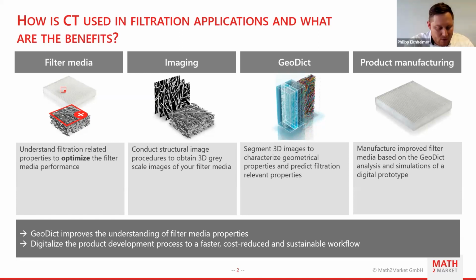Yeah, so in general, to use our software quite well, we have a rule of thumb. The smallest fibers, if you talk about fiber structures, should be resolved by 3 times the voxel size. This is to have a good representation in the software. And this limits us, I will also talk about this in a couple of slides. This limits us to the smallest fiber of about 1 micrometer, as when we have very good conditions, we have micro CT resolutions of 300 nanometers. So roughly 1 micrometer is the limitation we have here.